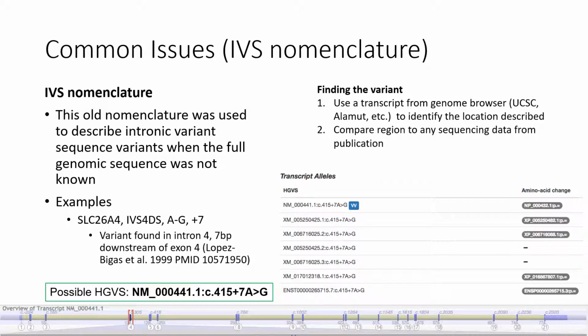And we can see that this does successfully map to a variant in the allele registry. When we're looking at this, we would also want to see, just to make us a little bit more sure of ourselves, if it does also correspond to a different transcript that may match the numbering on the transcript in the paper. So as you recall, the paper was referring to an amino or a nucleotide somewhere in the 600s.